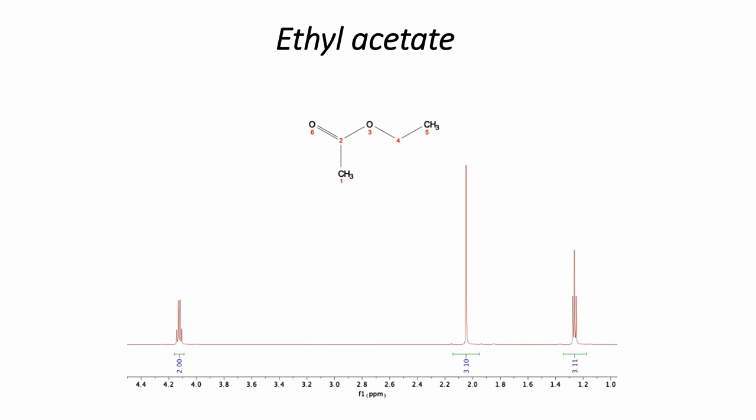So we know we can look at our molecule. We've got 2 methyl groups, so we can guess that these are both from the methyl groups because they integrate to 3, and that this is from the methylene because it integrates to 2. So why is this methylene all the way down at 4 and these are up here? Well, what's the methylene next to? It's bound straight to the oxygen. So the oxygen is withdrawing the electron density away from that methylene, and it is shifting the peak, what we call downfield, which means to the left on an NMR spectrum.